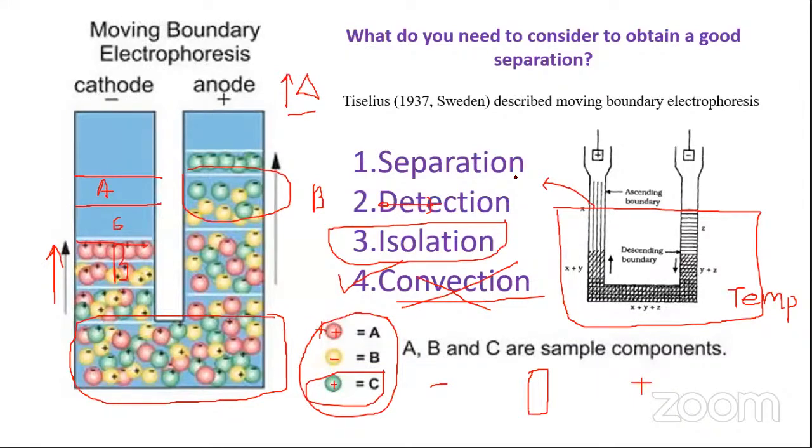Tanaya says yes. The problem is this entire liquid situation. Have you ever tried this? Imagine that there are two solutions which are kept together. They are miscible with each other, but they are kept together, and one solution is at the top with a very slight layer.